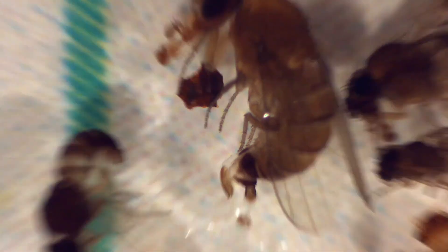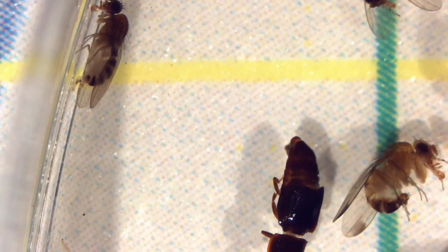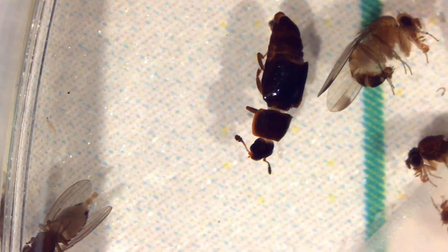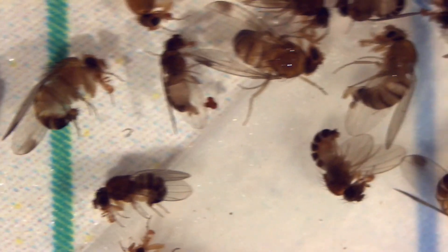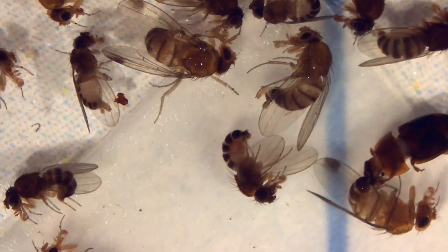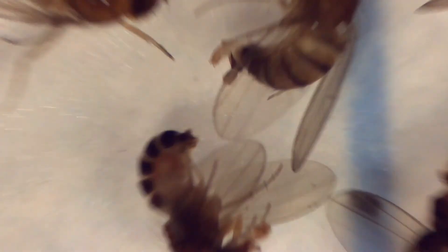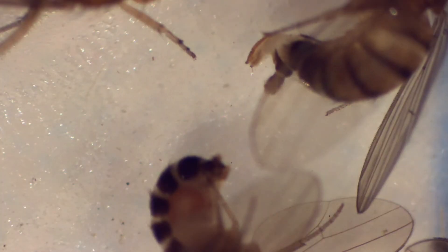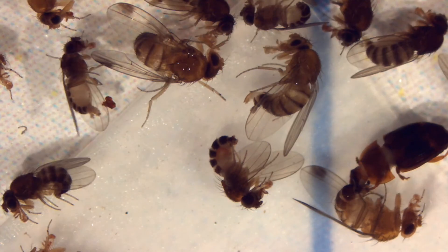Note the general golden color of the body and the stripes that go all the way across the abdomen. Moving down to the edge of the petri dish, there's a male in the center, there's another male in the center, there's a female in the center, there's a male in the center, there's a male at the bottom right. We'll zoom in — and you can see the teeth on the ovipositor, which confirms as a female.